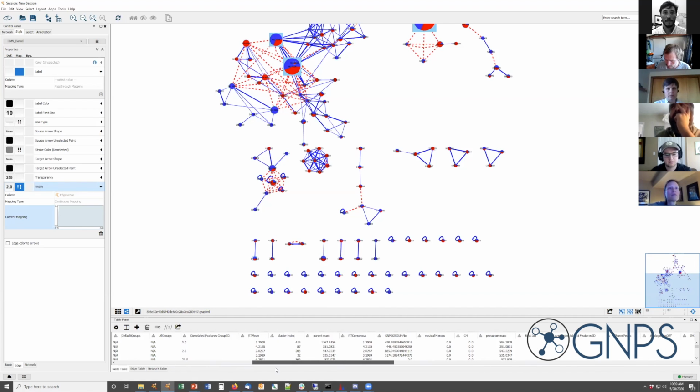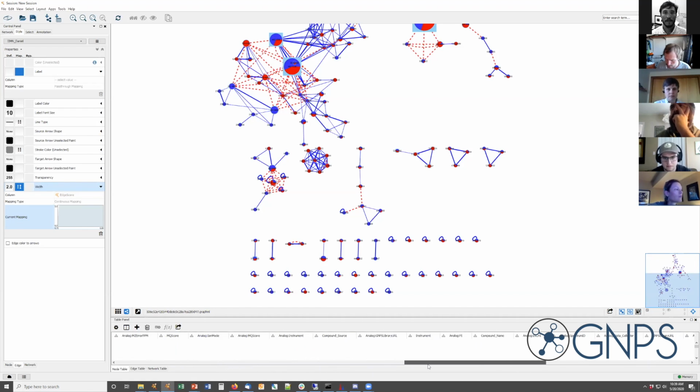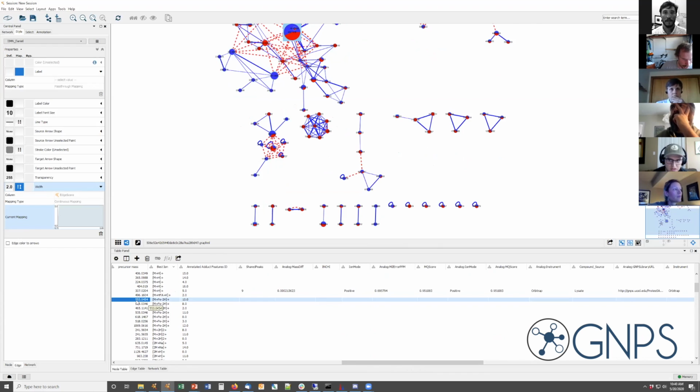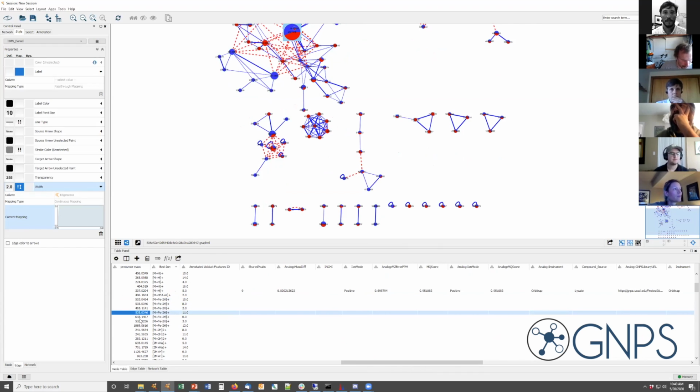best ion, if I can find it. Here we go. That should be a better way to choose the color. I could pre-select the columns, but then I have to go through that anyway. Now I can simply check all the nodes here that have M plus iron minus 2 protons.